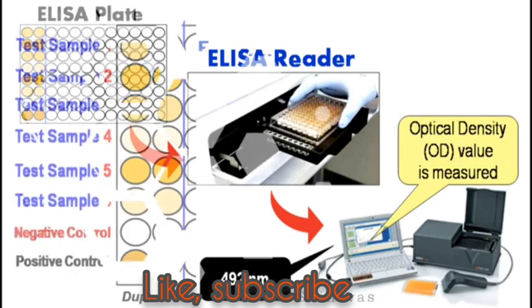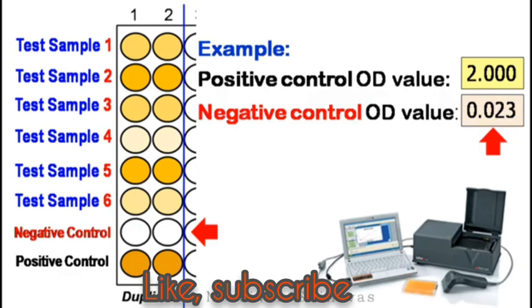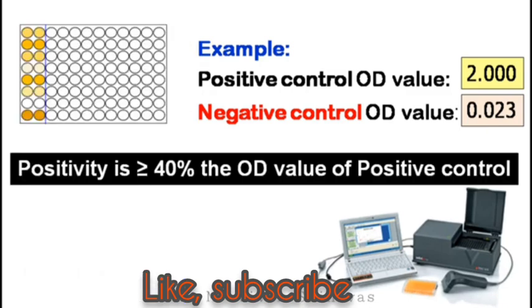for each well. For example, for the positive control, if you are getting an OD value something like 2.000, and for the negative control, you may get an OD value something like 0.023, you can consider the test experiment is valid. Then, the positivity is more than or equal to 40% of the OD value of positive control.